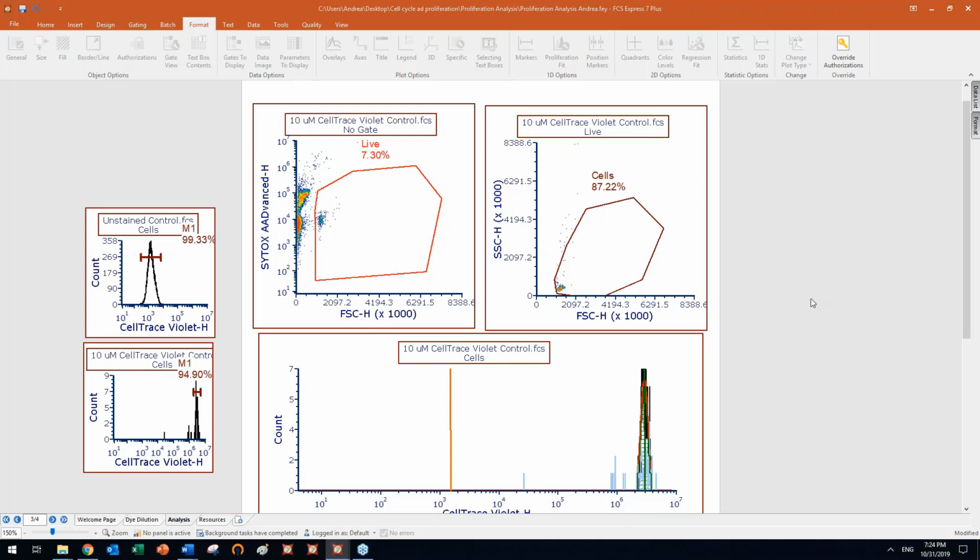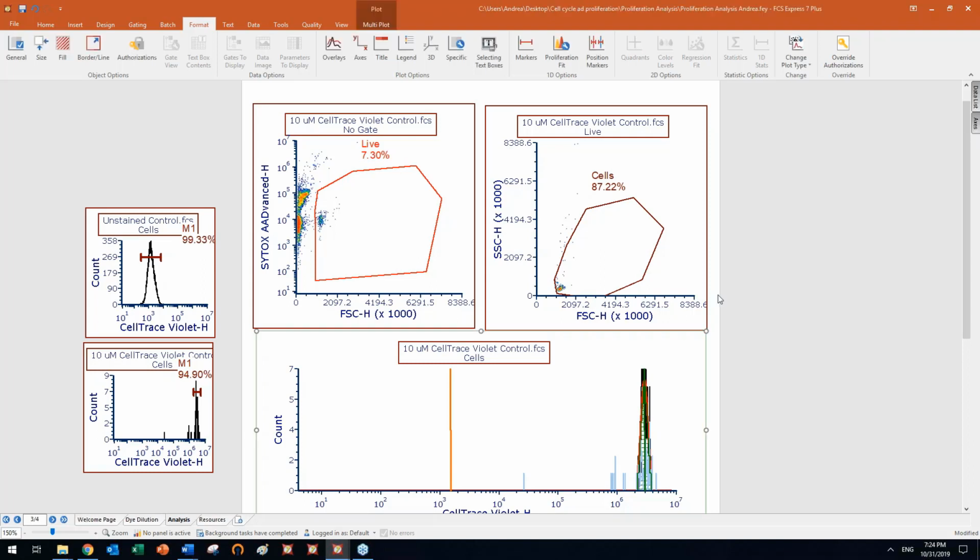Again, I think this is pretty much what I wanted to show you. I want to just summarize. Oh, I want to add something actually, which is pretty important.